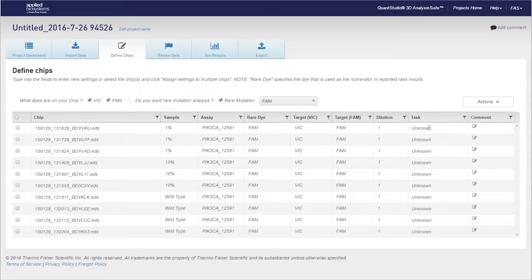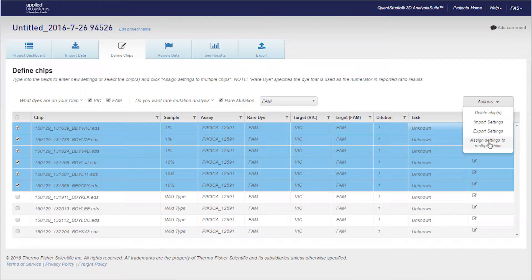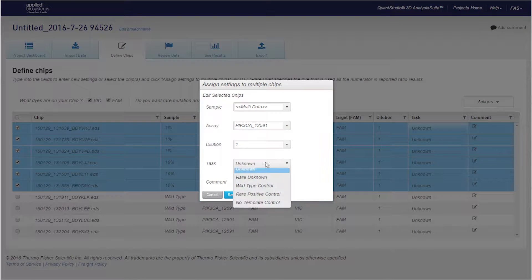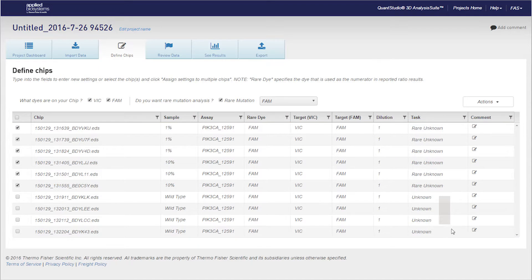First, assign tasks to your chips with the designation of rare unknown, wild type, or no template control in the Define Chips tab.